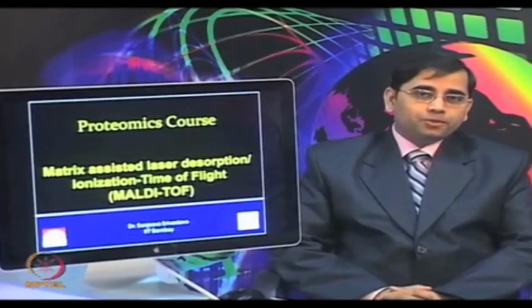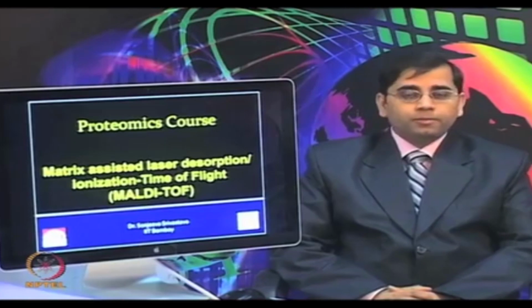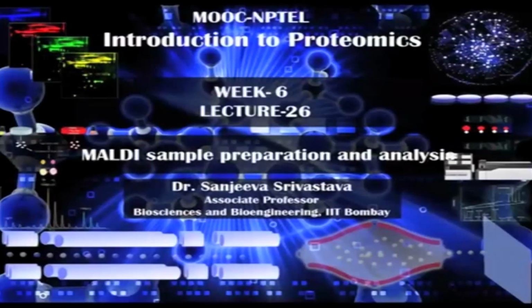Welcome to the Proteomics course. Today we will talk about matrix assisted laser desorption ionization, time of flight, MALDI TOF.